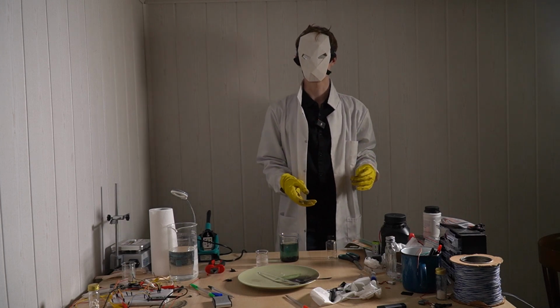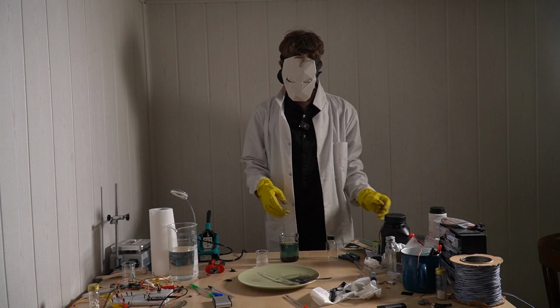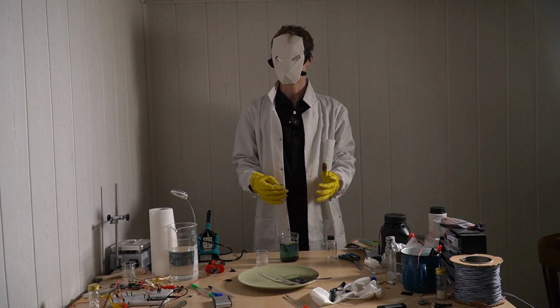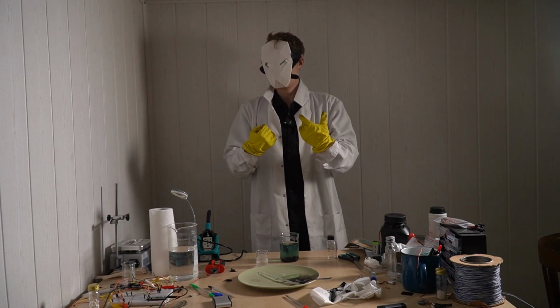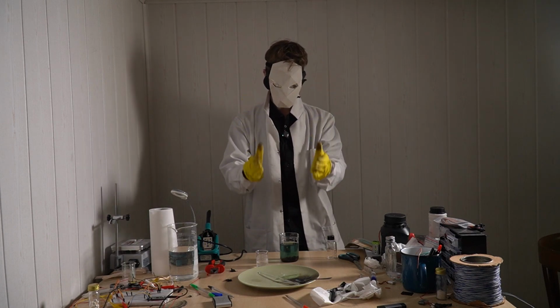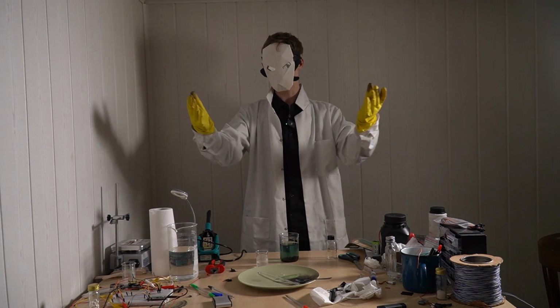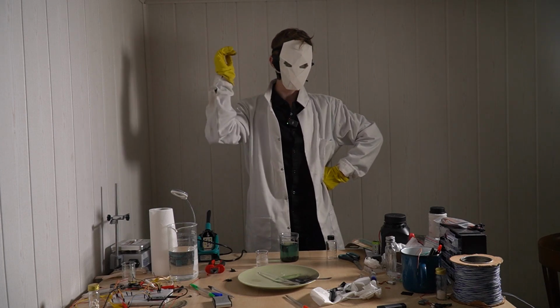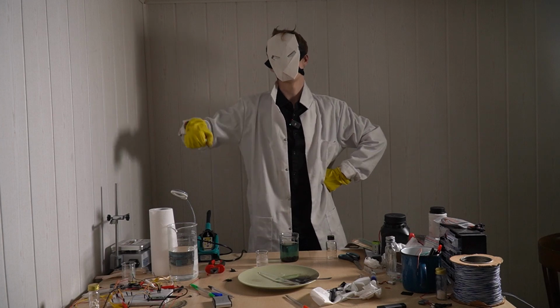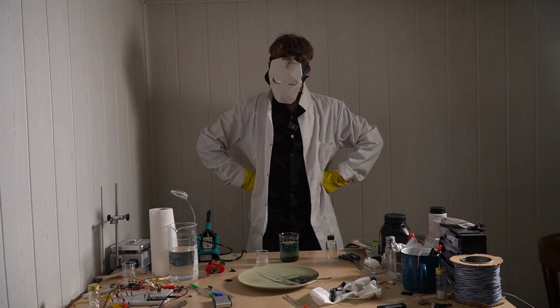But second of all, I tried mixing it with some potassium hydroxide, and also I tried pouring it over a leaf, and it like didn't corrode anything. And we all know that acids eat away organic things, so it should have absolutely demolished this leaf. So yeah, it's probably not an acid, because that's what acids do, right? They react with bases and they eat away organic things. Except, what if they don't?